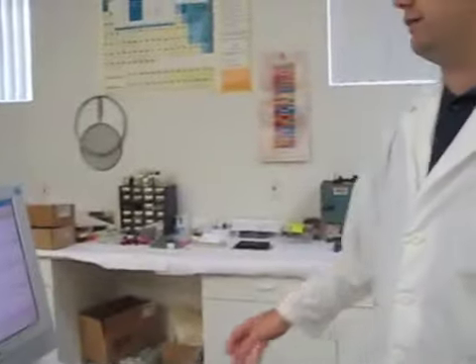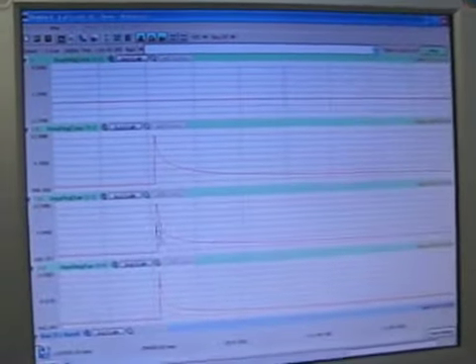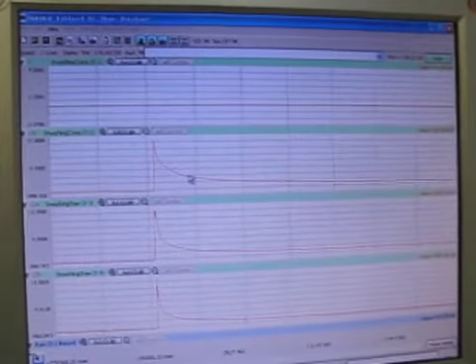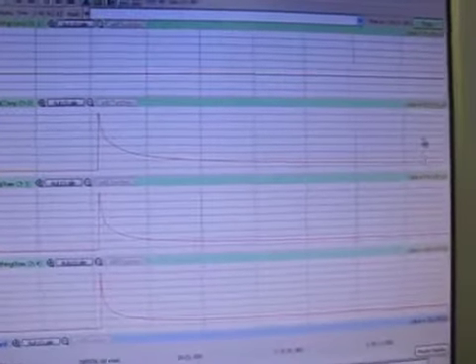I wanted to show the full range on DataTrack software to show this is the point where they were immersed in PBS buffer by the vertical lines, and they've slowly polarized, coming down to a baseline current less than 1000.